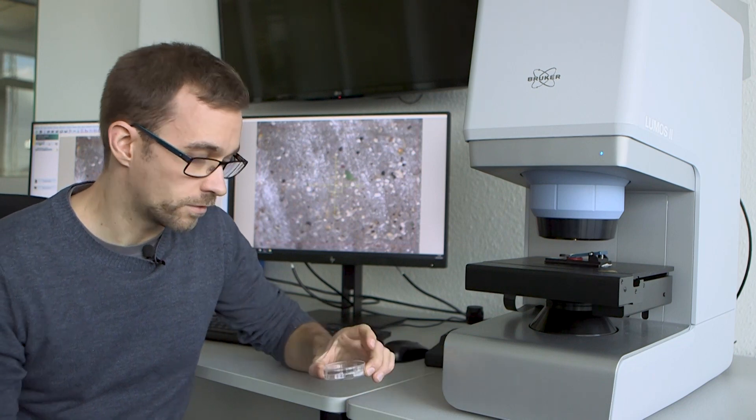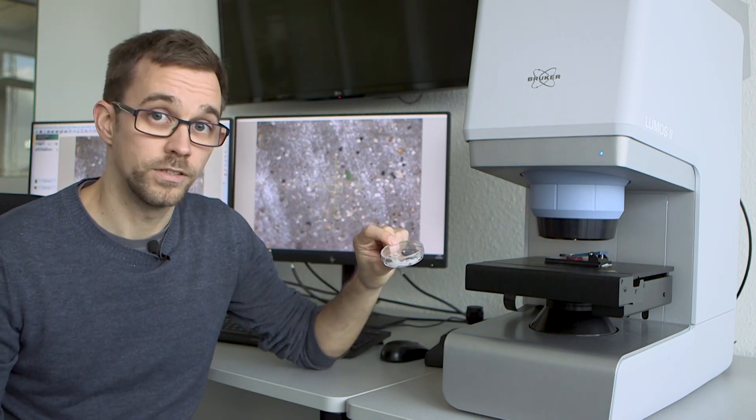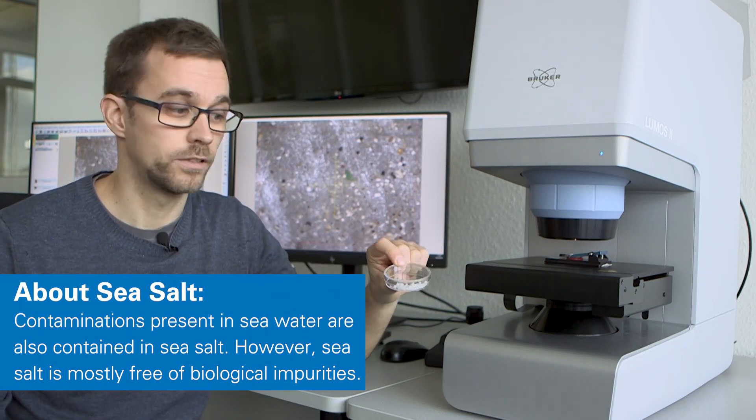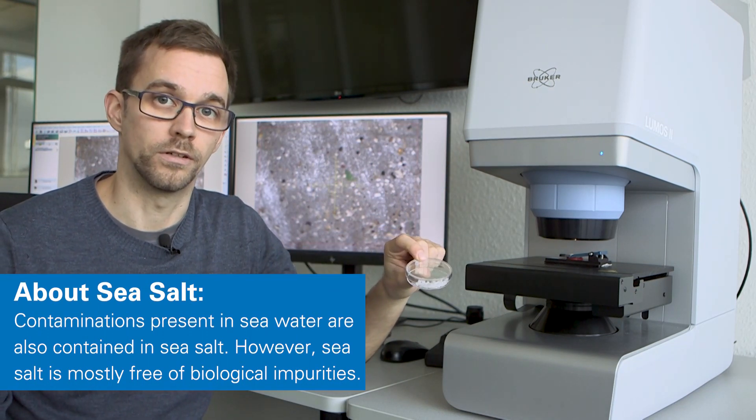And we are going to focus on the analysis of the sea salt sample with the Lumos II. So we're going to dissolve it and then filter it and for this we need to go to our laboratory.